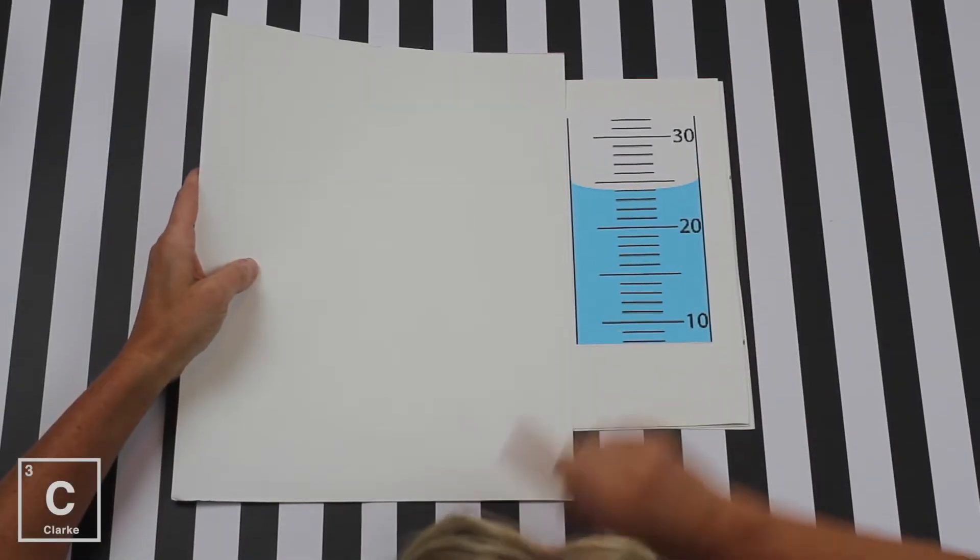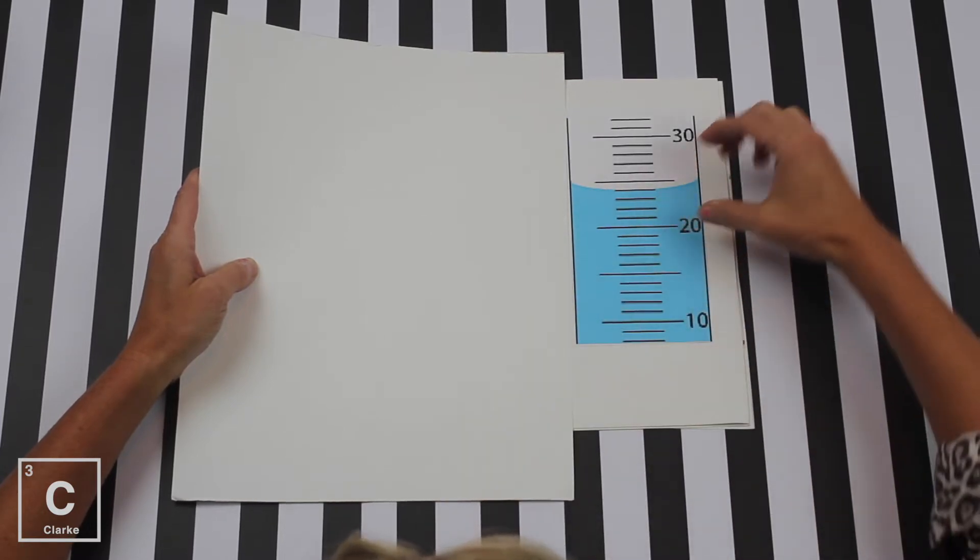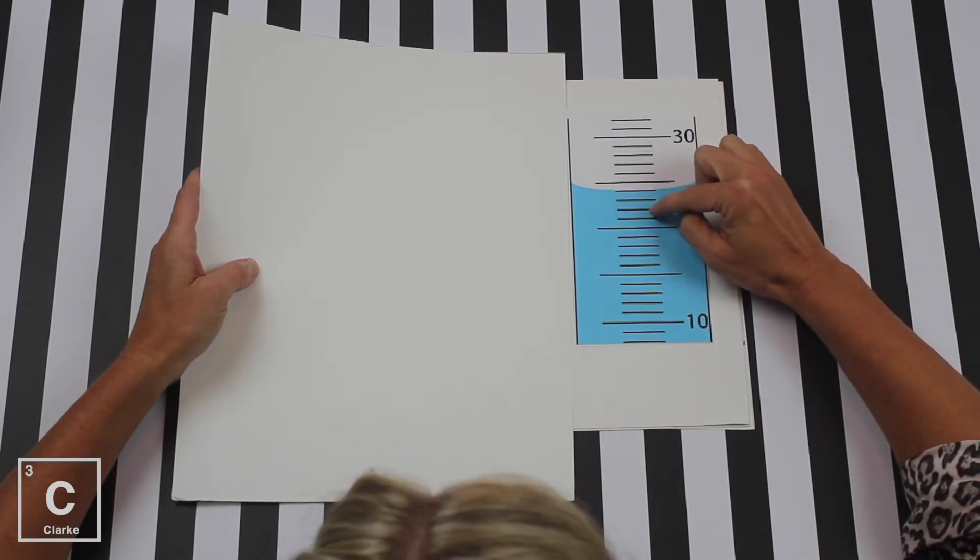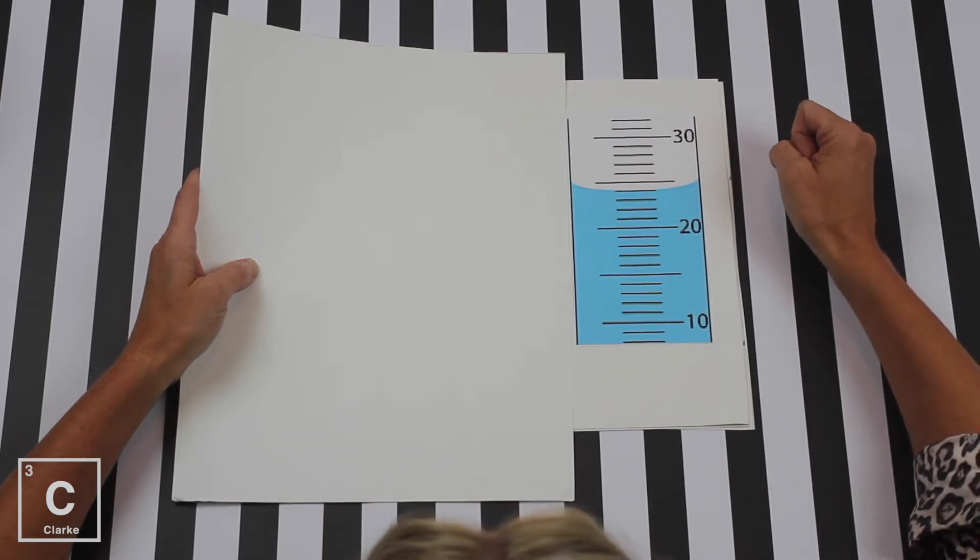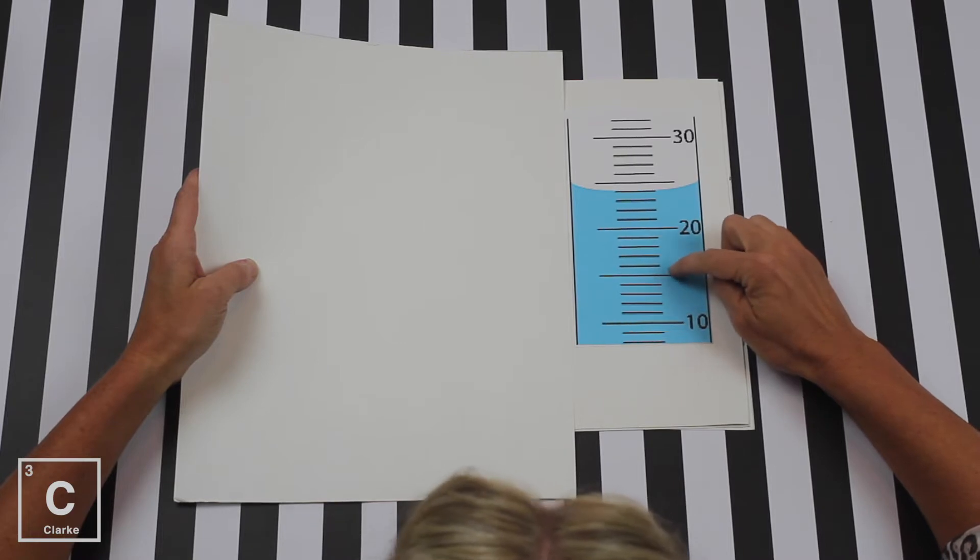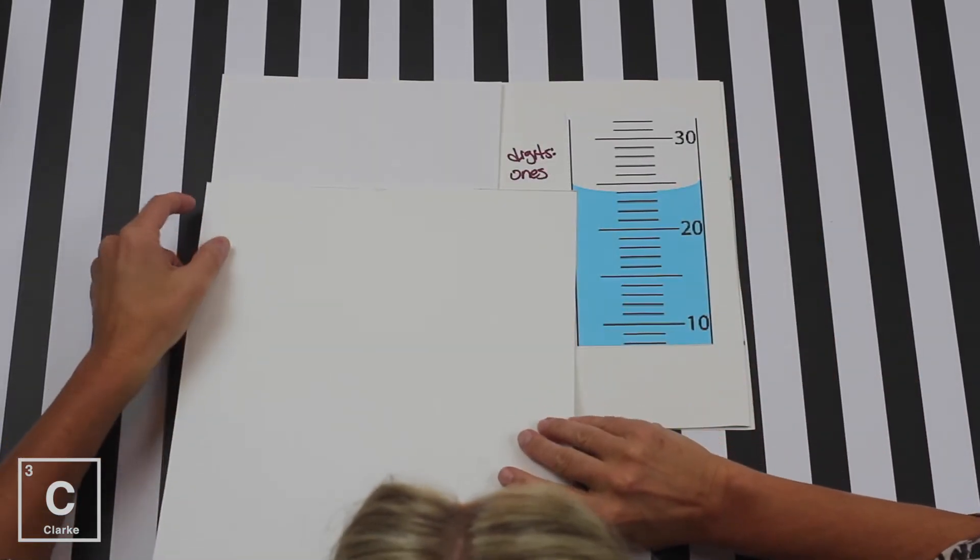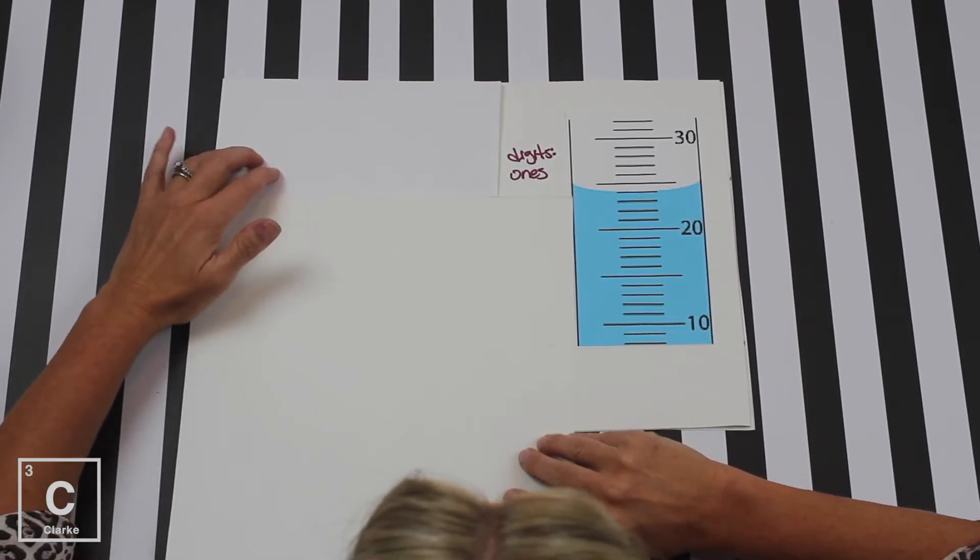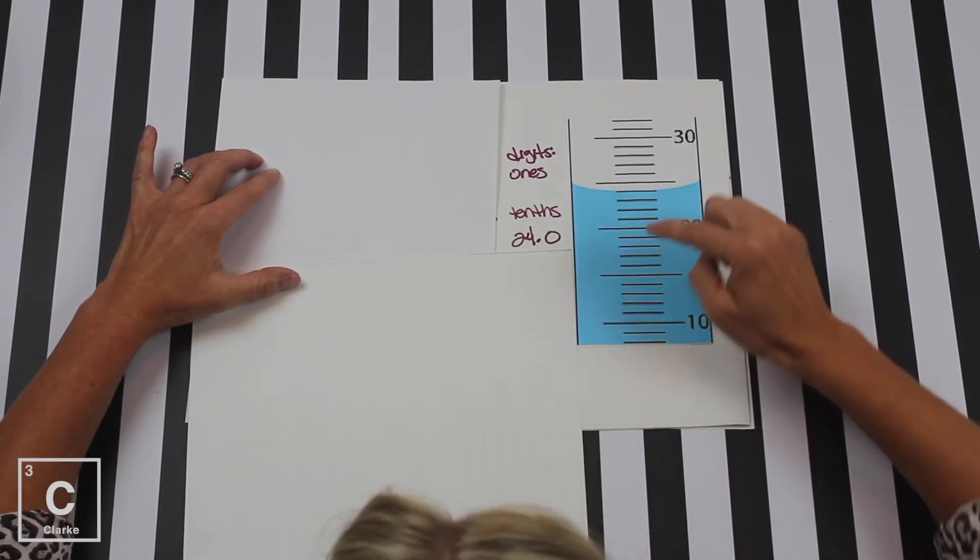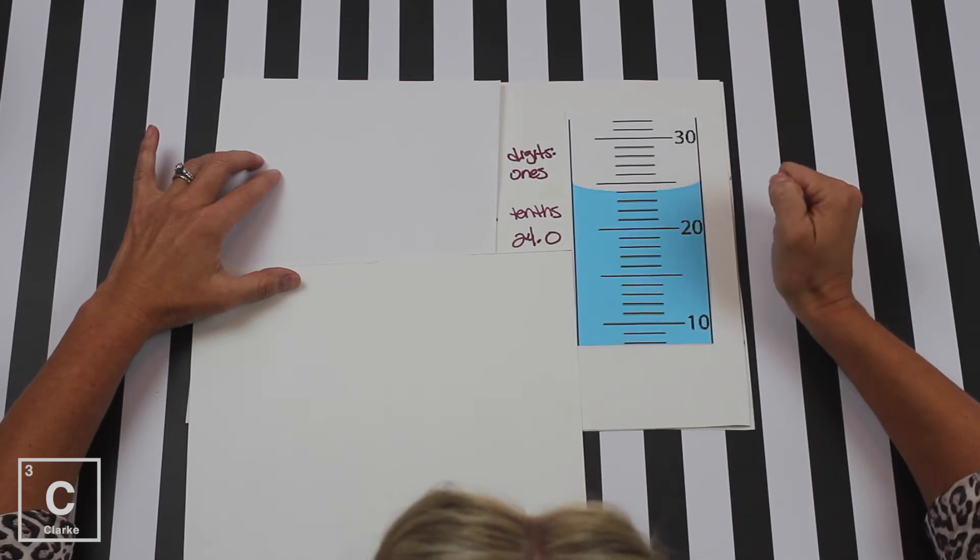Let's try that again. So let's look at our second graduated cylinder. Again, the first thing we need to do is figure out the increments of measure. What are the littlest lines telling us? So again, we see a 20 and a 30. That's the tens. And so the ones is going to be what's here. This is 21, 22, 23, 24. That's a little bit different than the last graduated cylinder. Every piece of equipment is going to have different increments. Every single time, you're going to have to figure out the increments and estimate one past that. So this graduated cylinder measures to the ones place. That means when we estimate our digit, we're going to estimate to the tenths spot. Our answer has to have a tenth in it. And if we look, we've got 21, 22, 23, 24. And again, the water line is exactly on the line. So we're going to estimate that as a zero. 24.0.